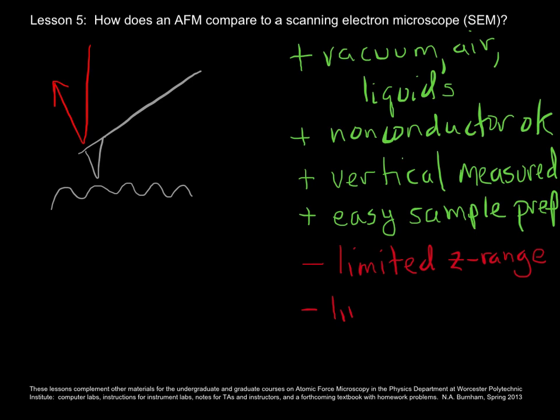And also the magnification, the lowest magnification, i.e. when you want to see all of the sample, well, you just can't. You can only see maybe 100 by 100 microns at a time. Whereas in SEM, you can see up to about a centimeter of your sample or so. So many AFMs, you use an optical microscope to see where the cantilever is over the sample, and that adds some complications and expense.